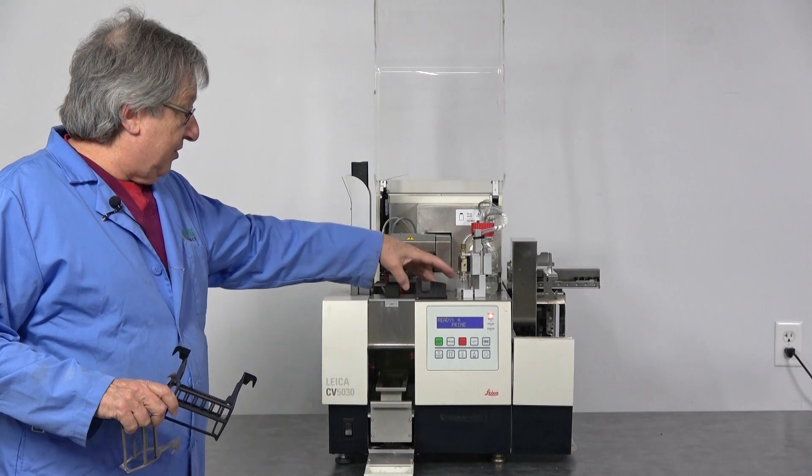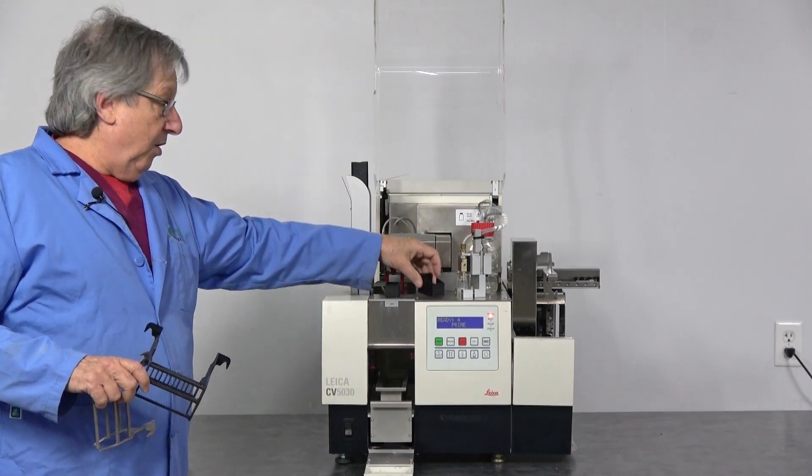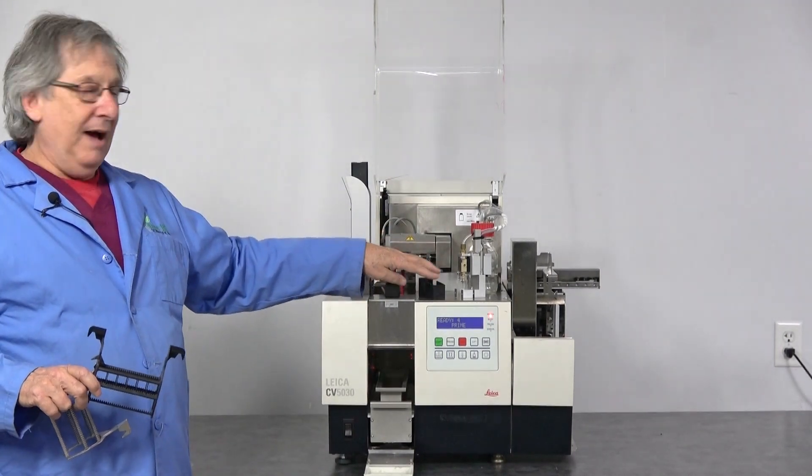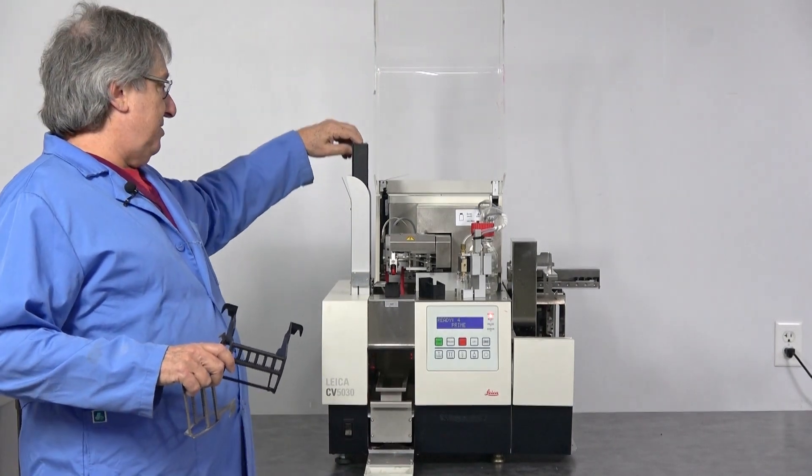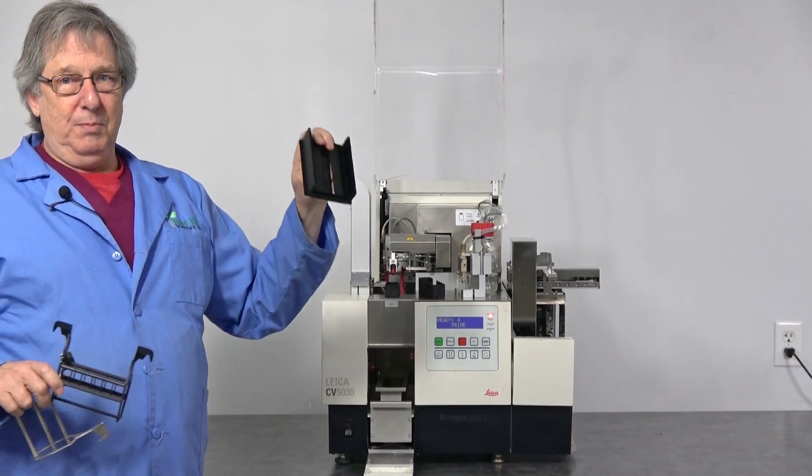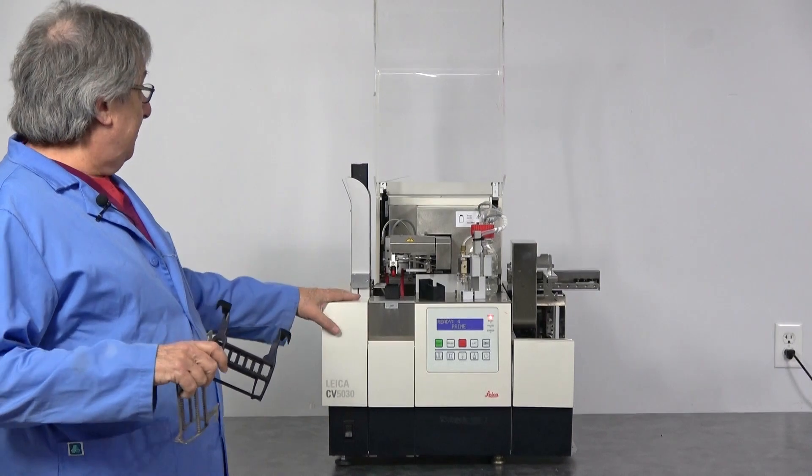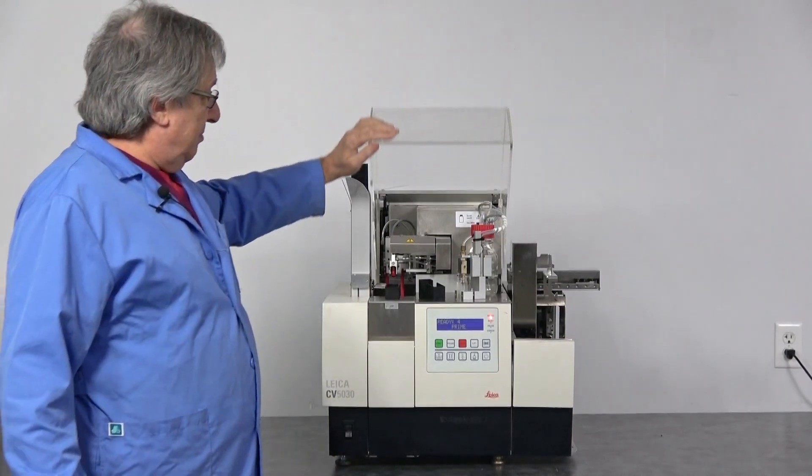These little trays - let me know, I have some. This last group, you bought plenty of extras. Having racks used to be important. Anyway, that's the machine.